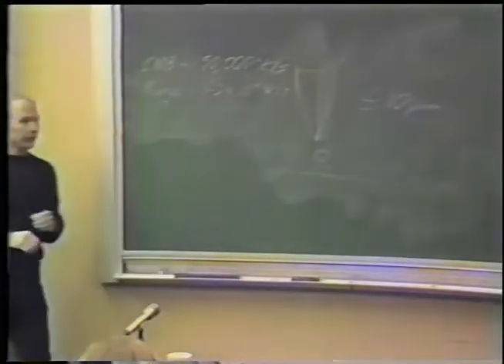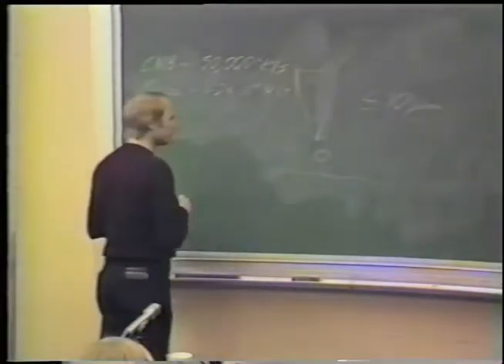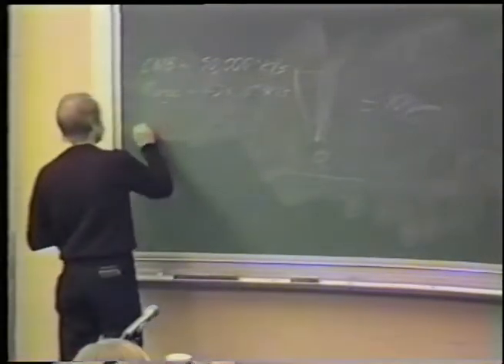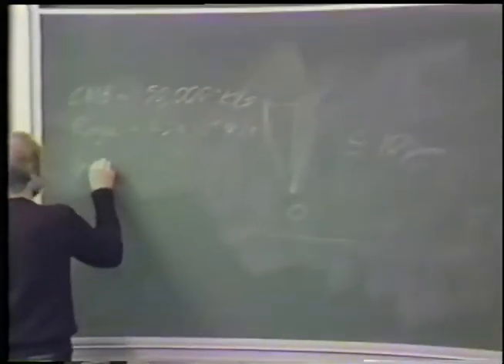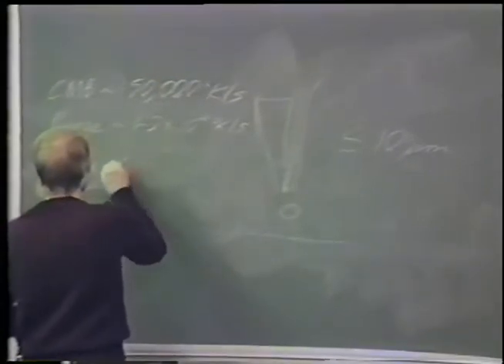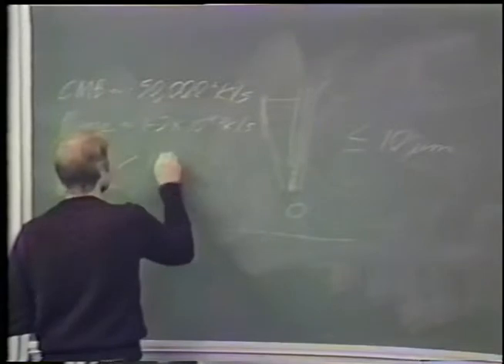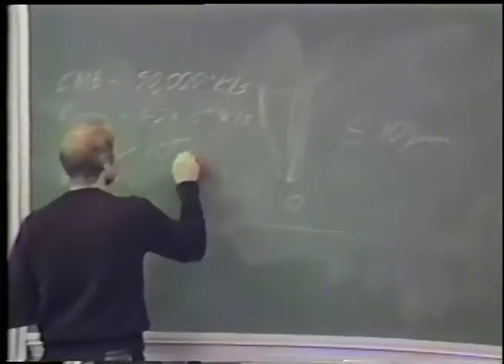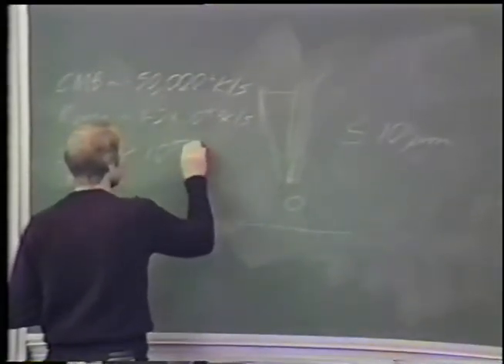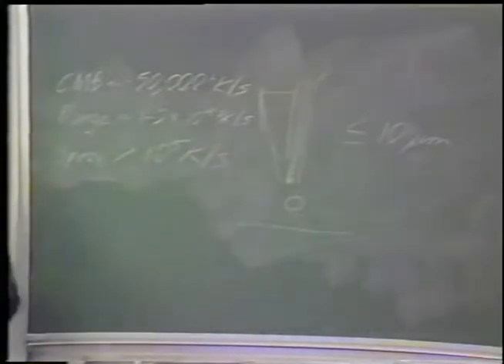Not as fast as one would like, but fast enough to get ultrarapid freezing in a thin enough sample. In this technique, the rates exceed probably 100,000 degrees Kelvin per second. So you can get the fastest known cooling. But there are some problems.